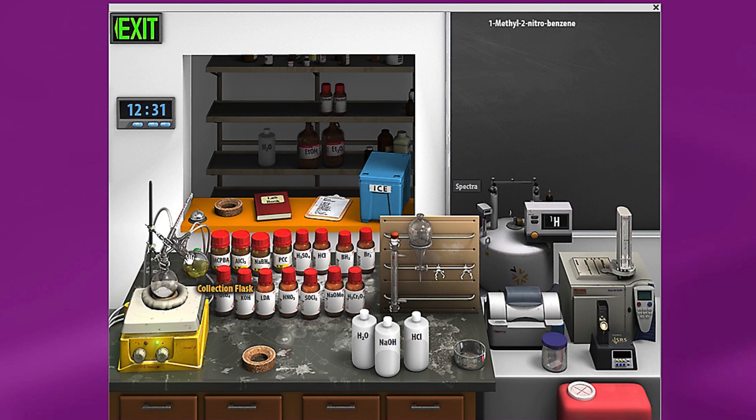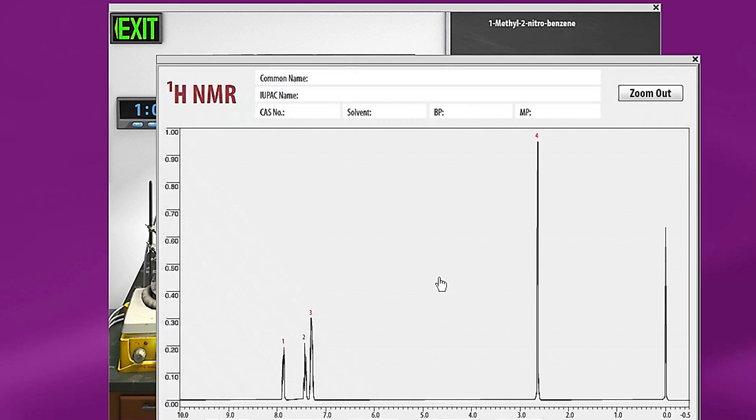So depending on which one you want to keep. Say in this case, I want the two nitro, just grab the collection flask and bring it right here. You can see that's all it has in there. Then you can go ahead and do your characterization. For example, you could do a proton NMR liquid and it will pull up your proton NMR for your pure product.